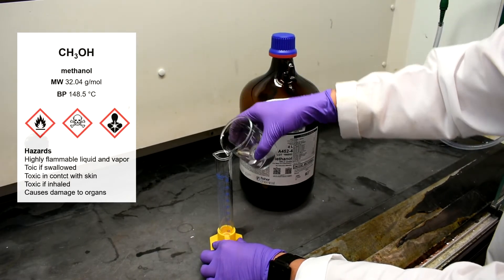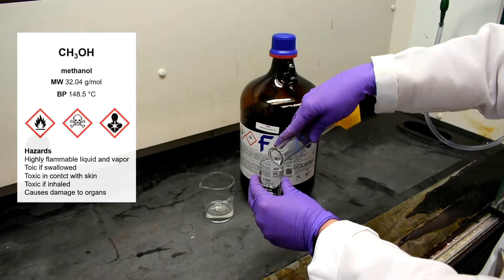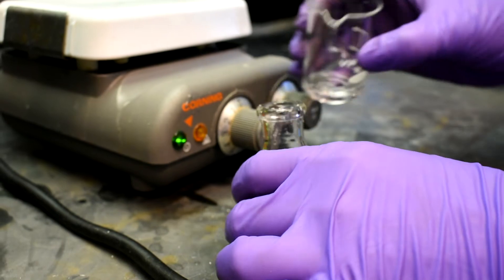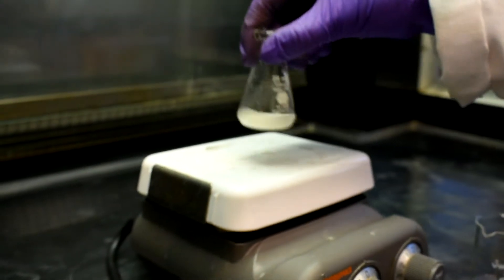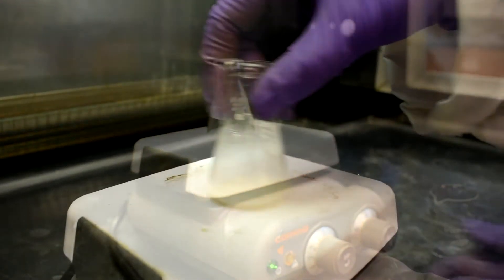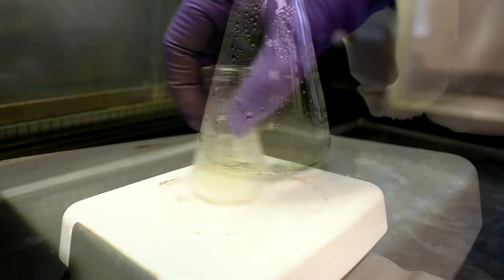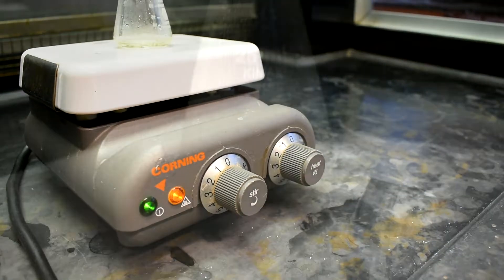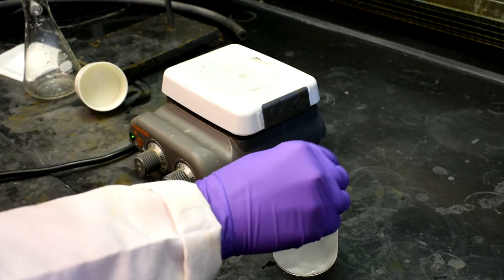Transfer some methanol into a beaker and measure out 1–3ml. We will use the methanol for the recrystallization because it does not fully dissolve our product at room temperature. Add the methanol to the Erlenmeyer flask and swirl to mix. Warm the solution on the hot plate until the product dissolves completely. After the product has dissolved, allow the solution to cool to room temperature on the hot plate, then place the flask in an ice bath until crystal formation is complete.